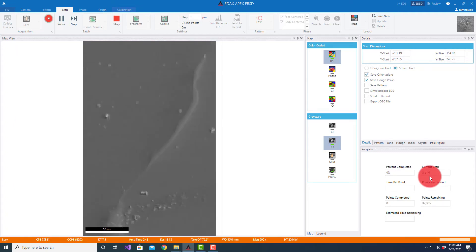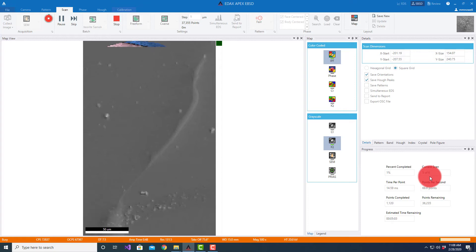And then this one's going to be our freeform. So based on where we've drawn it, it shows us a rectangle. Now it's going to fill in the points that are of interest there.